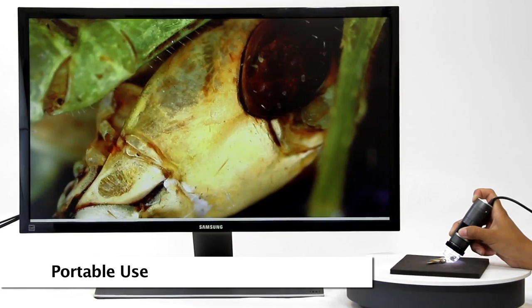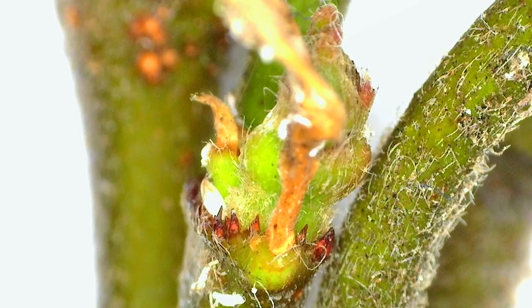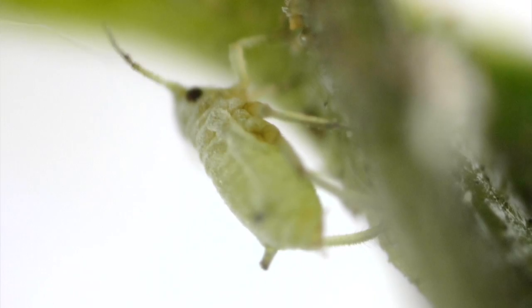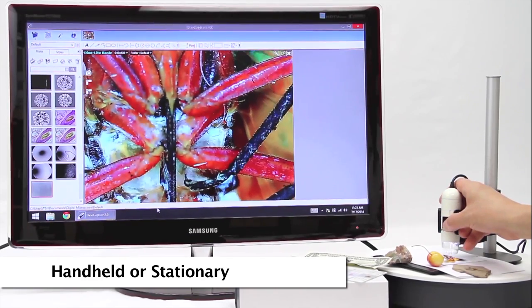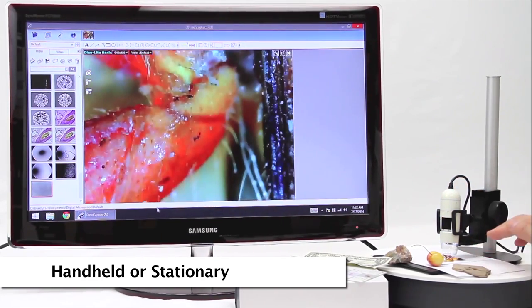The Dynolite is a handheld microscope camera with most standard models going up to 220 times magnification. USB models connect to a computer and include an easy-to-use software that allows users to capture images and video, as well as many other basic and advanced features. The Dynolite can be used as a handheld microscope, but using a stand is recommended for the best stability and imaging results.